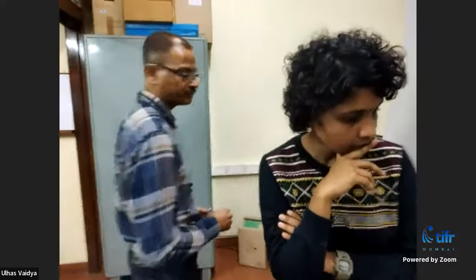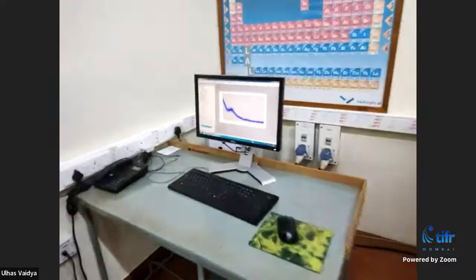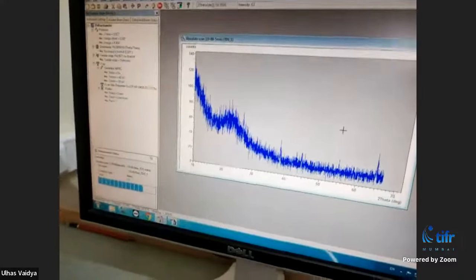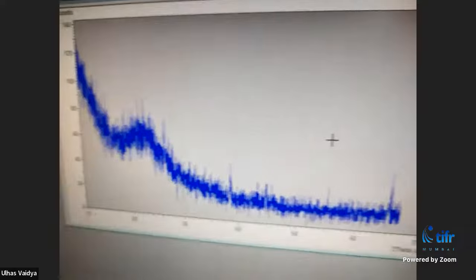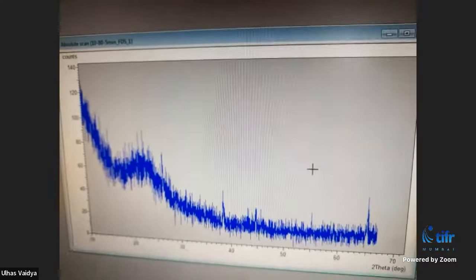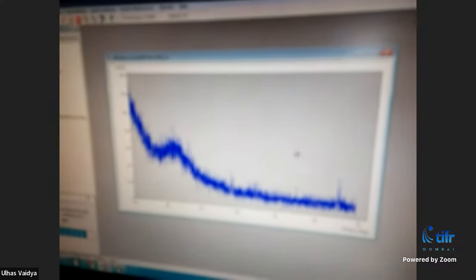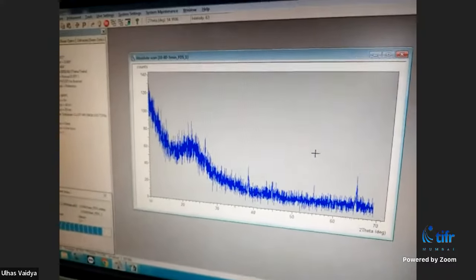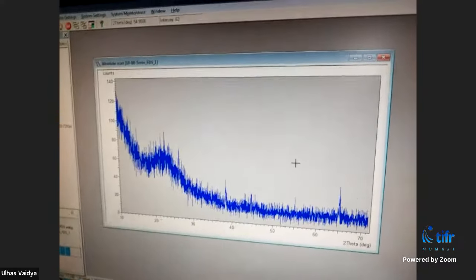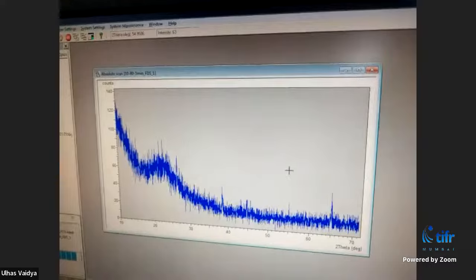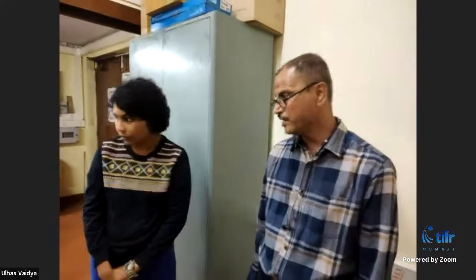The scan from 10 to 80 degrees shows no major peaks for the amorphous glass — just noise and a broad peak at 22. Now we load NaCl powder and see if we get any peaks. NaCl is a crystalline material with a rock salt crystal structure. We will compare the results. We are using powder and will explain why powder form is necessary. We let this scan run and compare.